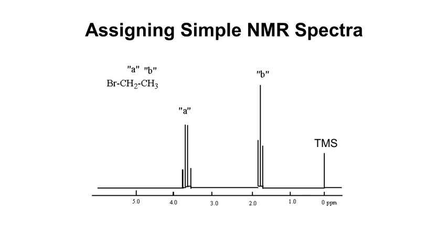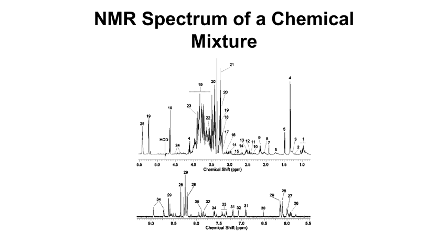But what we do in metabolomics is we look at NMR of mixtures. And those aren't particularly simple. There are lots of peaks there, and in fact, figuring out the chemical composition of a mixture using standard 1D NMR is not trivial. And we'll talk about how that's done. So our focus in NMR-based metabolomics is looking primarily at mixtures as opposed to pure compounds, but still trying to deconvolute the chemical shifts and coupling patterns to figure out what really is there.